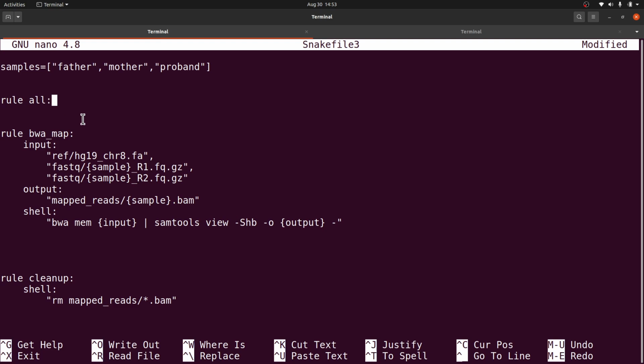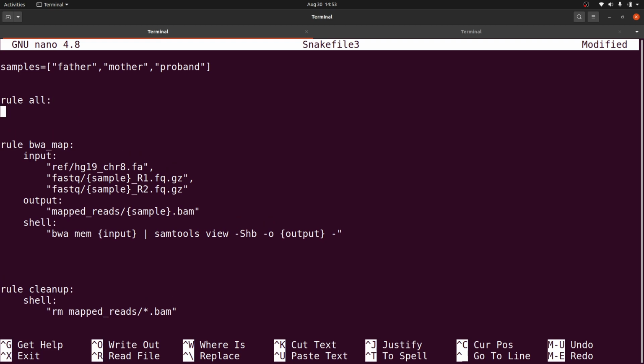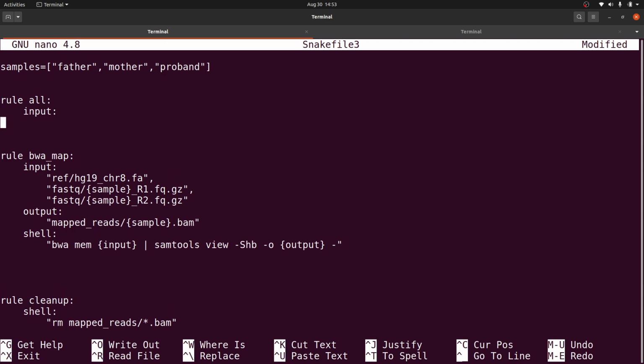But anyway, let's just start. Just follow my lead. Let's just type these things. Let's get it done, and then gradually you will get to understand the principle behind what we are doing. So first of all, we are going to use the input. We have to supply inputs. So again, you bring your input, you define it, and then the next line, you have your indentation or your indents. Then that's what you will do.